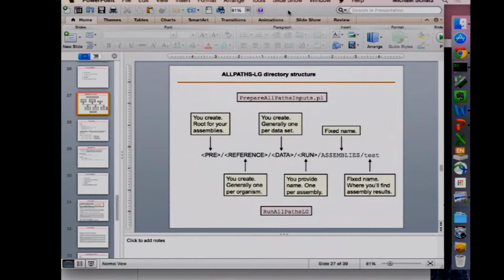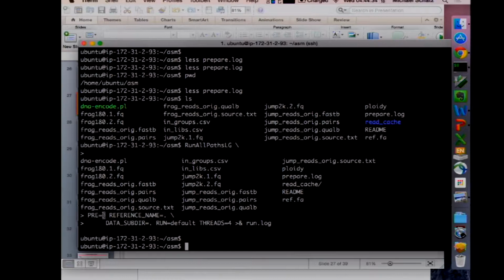So on the command that we just gave, normally it wants a separate path to represent prefixes, where all your assemblies live, the name of your genome, and all this stuff. So we've subverted, if you will, the Broad by just saying, yep, everything lives in this dot directory. Dot is a special Unix shortcut meaning everything's in the current directory. Behind the scenes, it's doing weird things like looking in the ././././. directory, which just means the current directory. Again, life at the Broad must be highly structured because that's built in. It's very fundamental to the algorithm. If you don't do that, it'll complain that you haven't set these important variables.